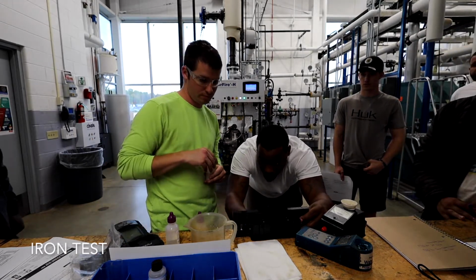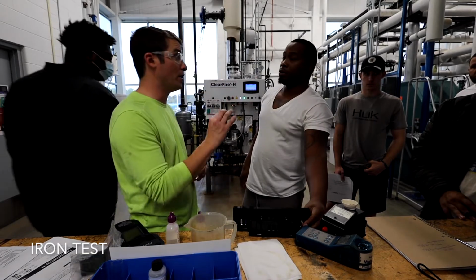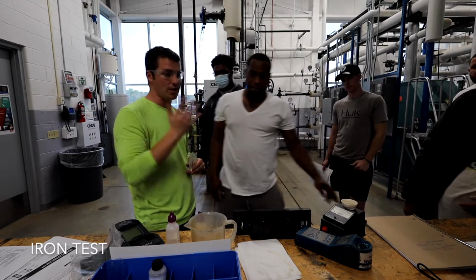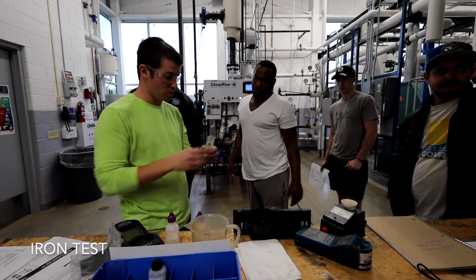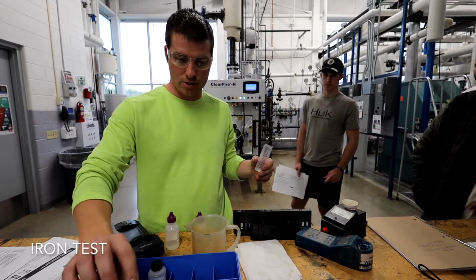So you were looking for this type of purple? Well, I ideally want it to be this: nothing, 0. None. We want none. If we have no iron free floating around, we know we're not corroding anything. Okay. And I actually think that, truthfully, it is lower than what I got. I think I got some of that sitting in the bottom of it, and it's going to screw it up. So, that's the iron test, all right? So pretty simple. They're all pretty simple, right? Just go step by step.